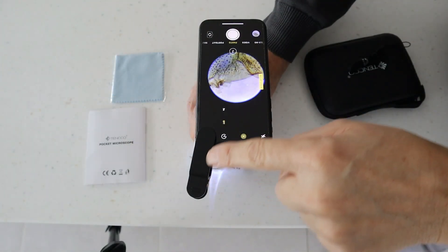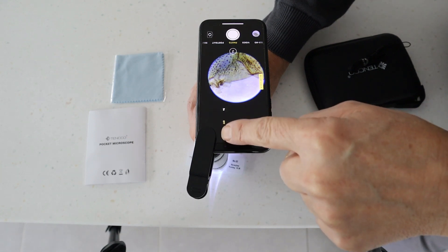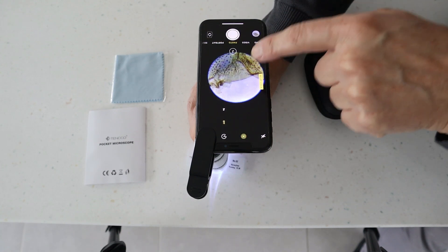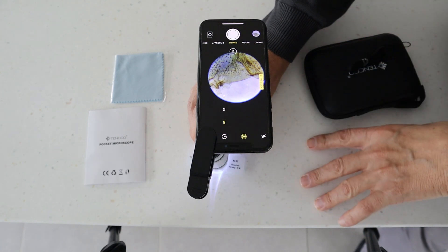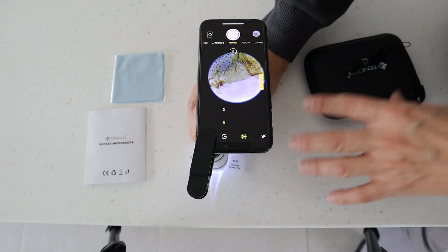You can see here how I'm using the phone clip — it clips onto the actual lens and then your phone just clips underneath like so, and that gives you this kind of view on your phone's camera so you can take photos and that kind of thing. So this is the Tenko Pocket Microscope — it's available on Amazon and it comes highly recommended.